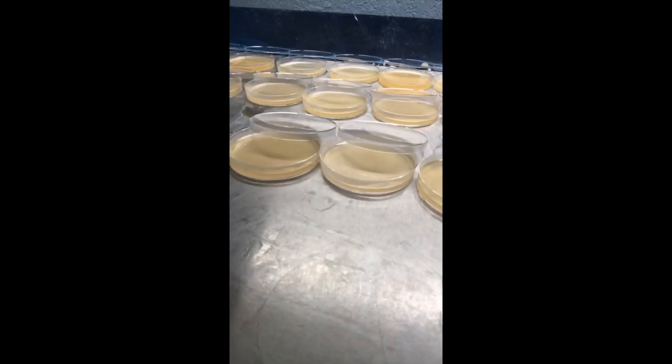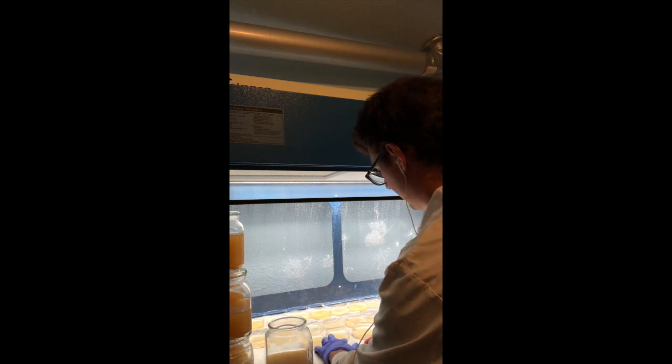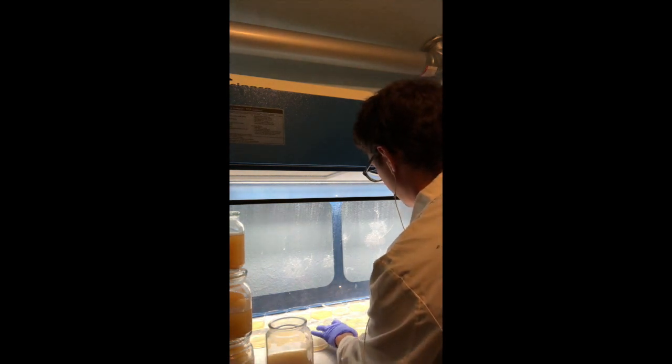So if you can see the condensation starting to form on the plates, that is something that I usually try to avoid. So to help prevent condensation, you just leave the lid off the plate and then wait about 2 or 3 minutes for that steam to evaporate, and then you can go ahead and push those plates closed for the next layer. So it's been a couple minutes and now you can go ahead and push these plates closed and get ready for the next layer.